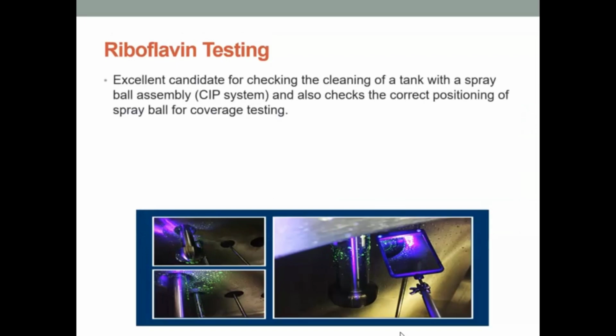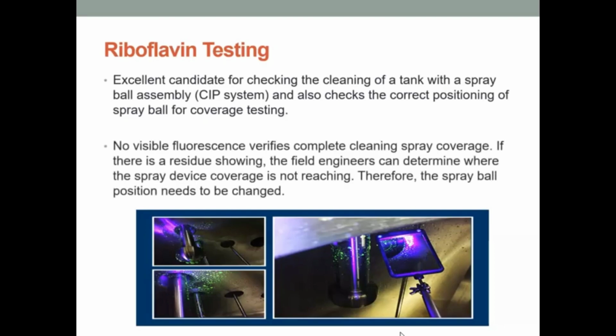Riboflavin is an excellent candidate for checking the cleaning of a tank with the spray ball assembly, your clean-in-place system. It also checks the correct positioning of the spray ball for coverage testing. When we're using a spray ball, we need to be sure that the spray is catching all areas of the inside of the vessel, and this is an excellent way to do that.